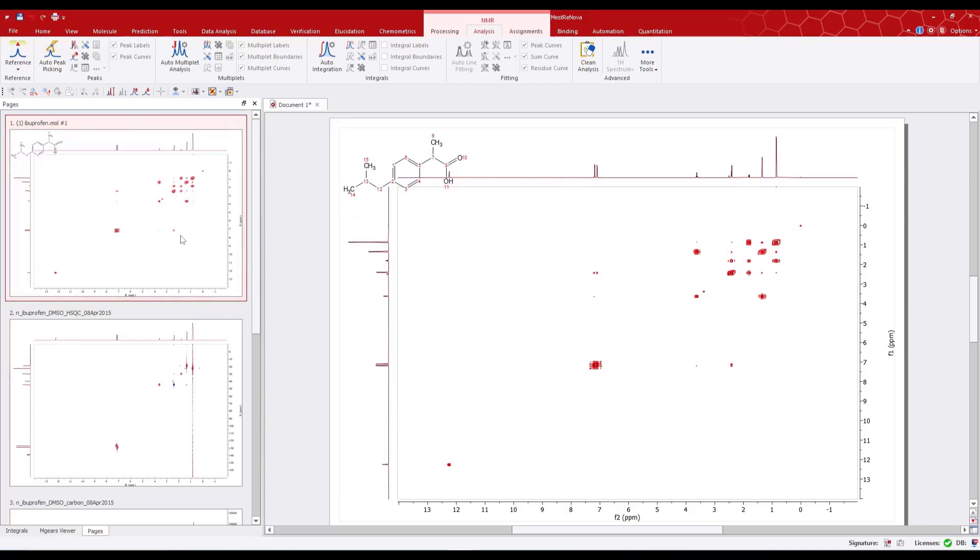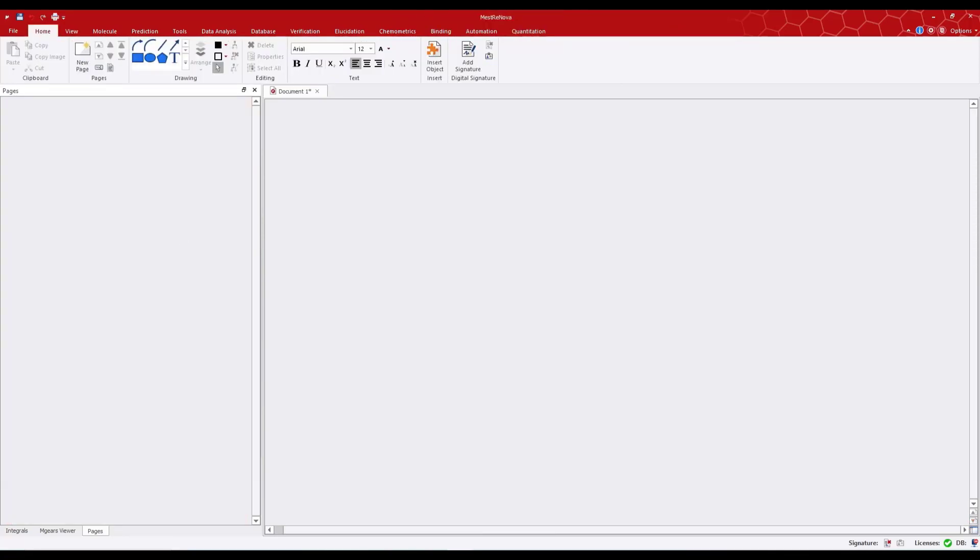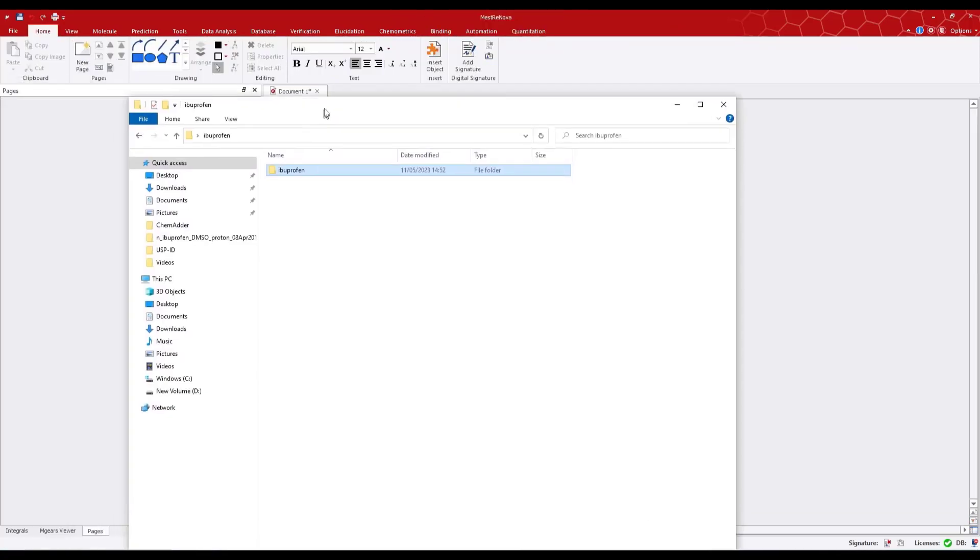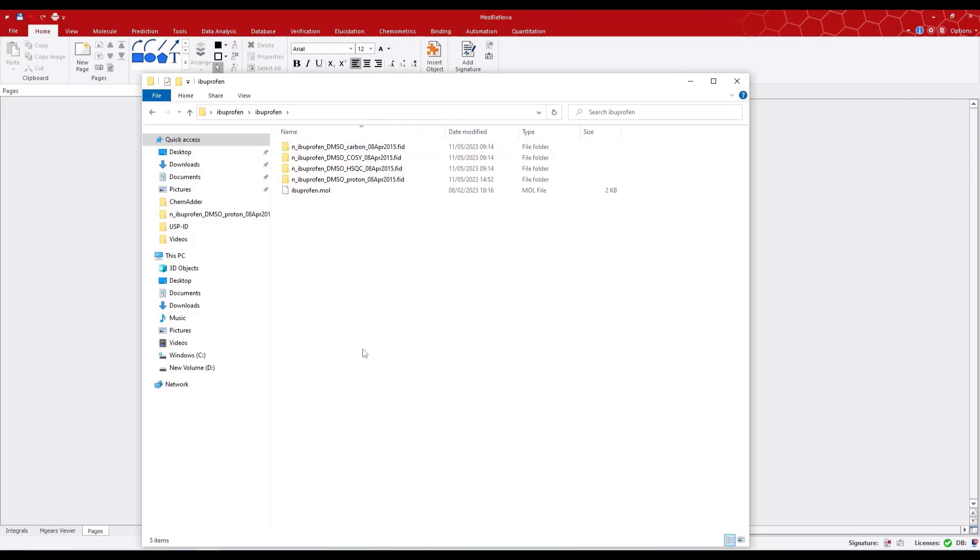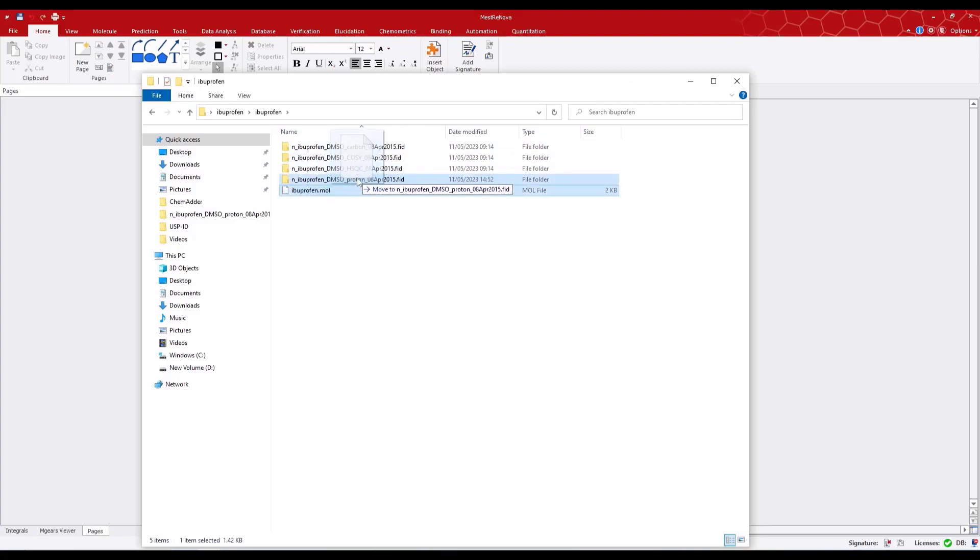This isn't always convenient. For instance, we may want to display the structure with the proton spectrum. We can change this by simply dropping the structure file into the directory with the proton data.